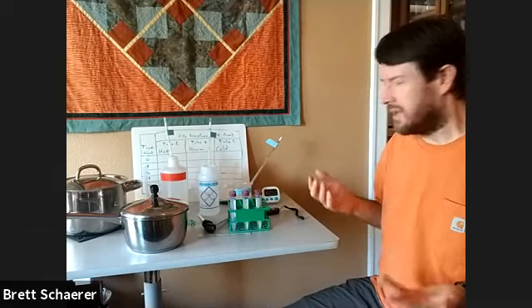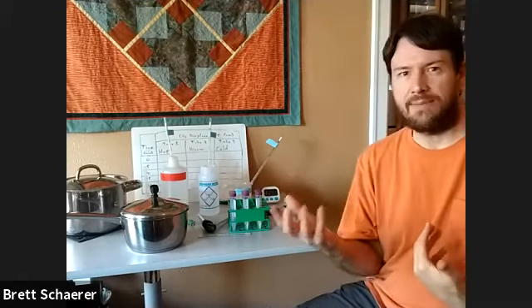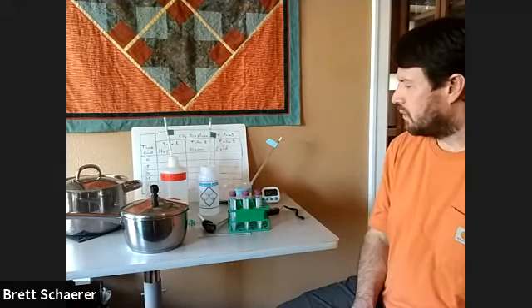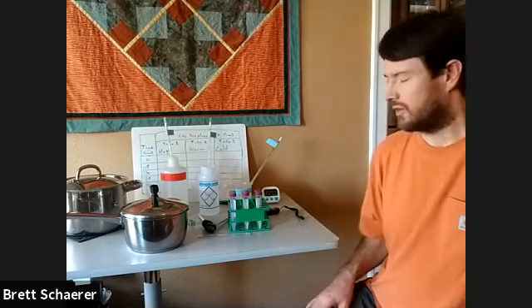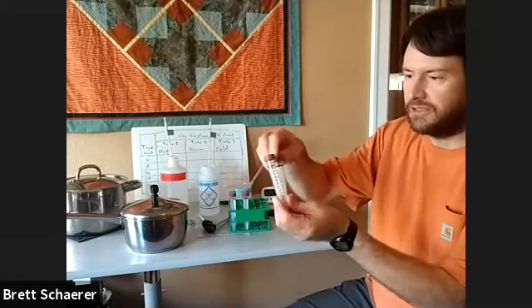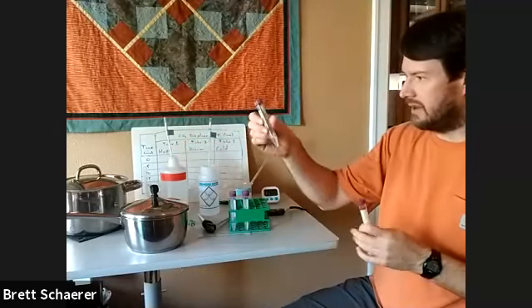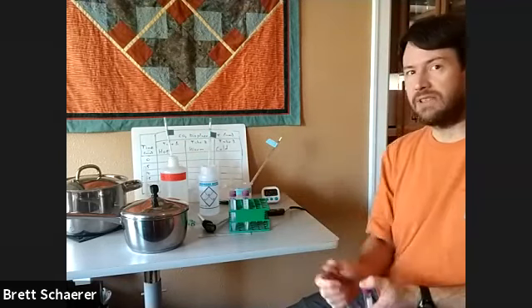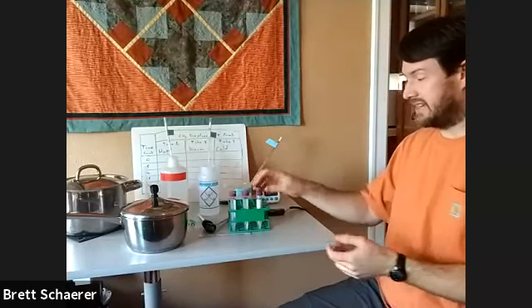But before I do that, I want all of the reagents, all of the solutions that we're going to be using to acclimate to the temperatures. So the glucose and the water and the yeast, we want those acclimating to the temperatures without the fermentation reactions starting to occur already. So to do that, I am going to fill up some centrifuge tubes with yeast and water, and then glucose. And then I will put the yeast mixture and the glucose in that temperature environment and let it sit for about 5 minutes to acclimate to the temperature.